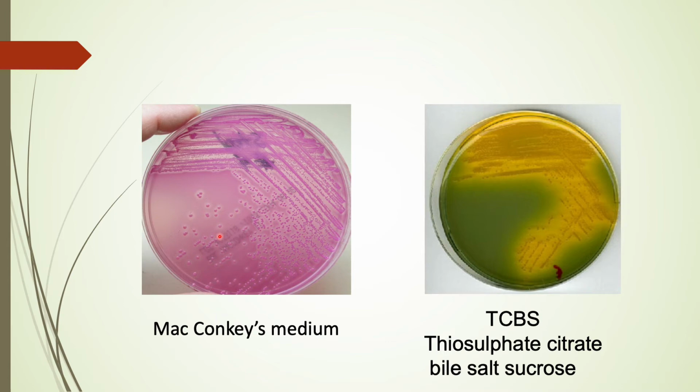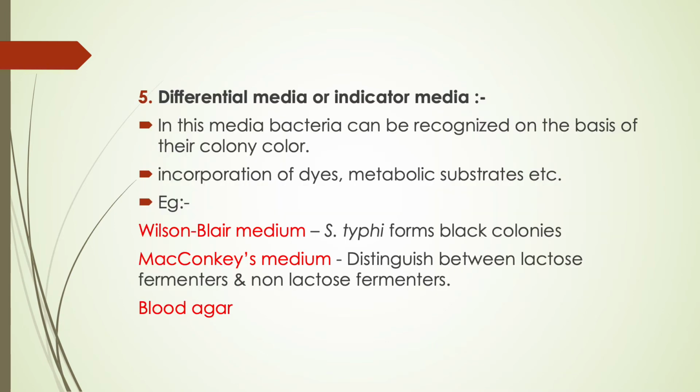This is actually the MacConkey agar. It's a selective media. It's called the selective media, and differential media or indicator media. So what is the differential media and the indicator media? Actually, it will recognize a colony color.